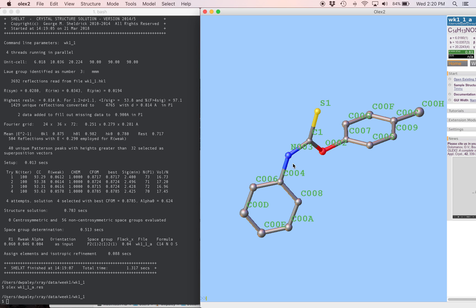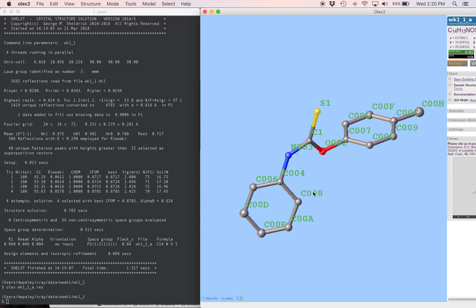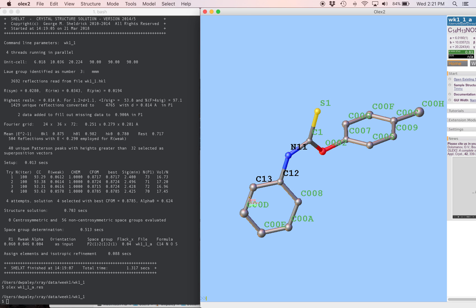Next, we want to name this whole side of the molecule starting from the nitrogen, all in order, starting from N11. So I'm going to type mode name 11, which is the first number that we want to assign. And now automatically we're going to go around, clicking these in order, and they're going to get numbered in order. When I'm done with this side, I'm going to hit escape.